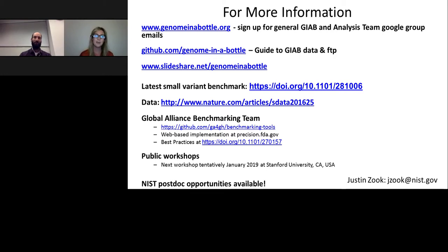Dr. Zook, how do you expect new methods using long and ultra-long reads to be useful in defining benchmark calls?